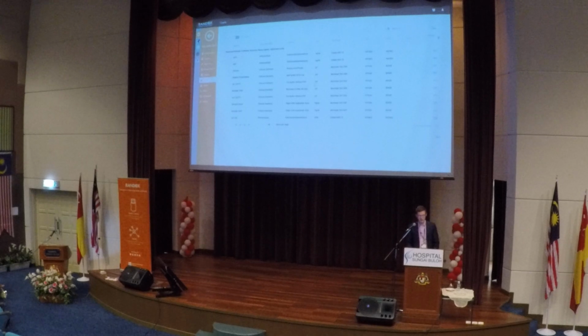So in this list we have all of our QC tests that we have registered. We can see that this is for Lab 1, which we've just titled Demo 1. So we can see all the tests registered for that lab. We can see the analyte name, the chemistry type, whether it's immunoassay, clinical chemistry, hematology, whatever else, the reagent method that we're using, the unit that we're reporting our results in, the instrument that this test is being run on, and finally the QC lots that we are using as well.